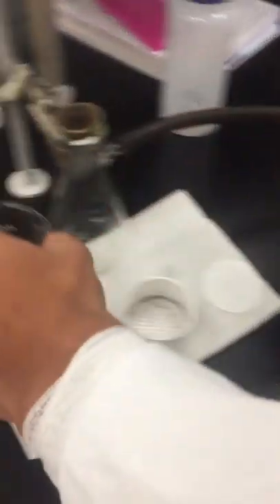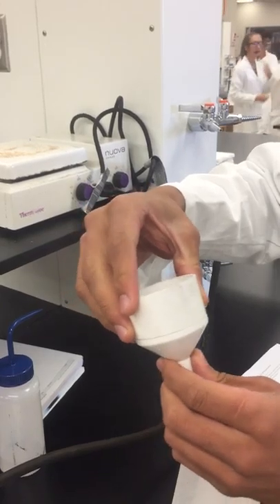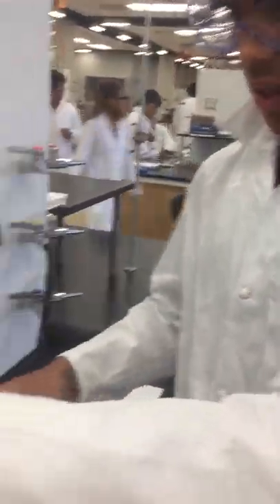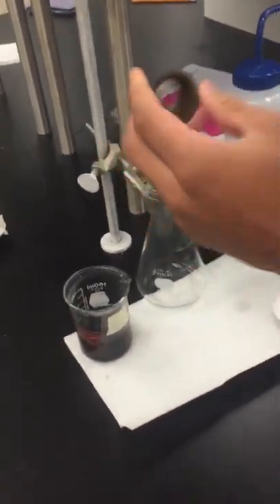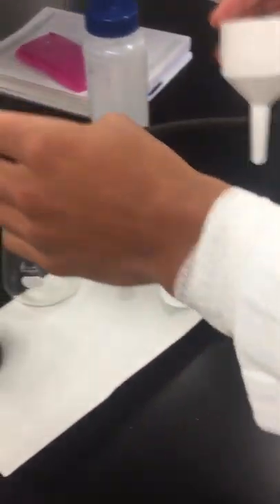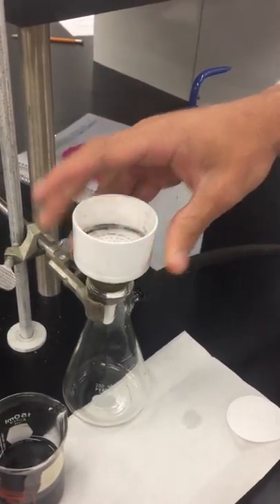The next step is to set up our Buchner filtration system. It's fairly simple — it's two parts: the adapter and the Buchner filter. All you do is press them together. As you can see, it's pretty stable. Let's put that right in the top. Please take note: this is a rubber stopper. This is going to help us get a more complete seal because without it this isn't very tight, but with it, it's much tighter.